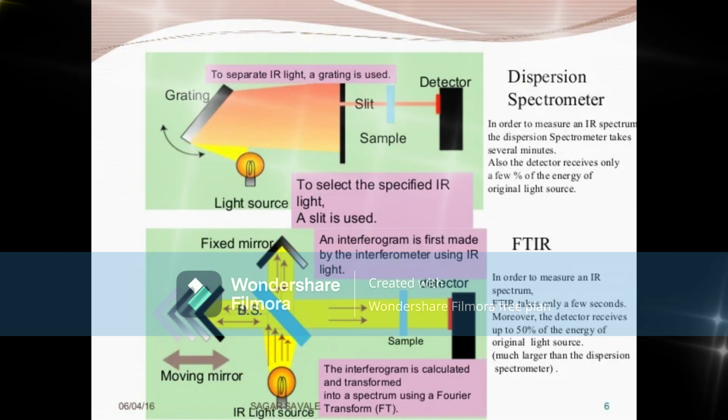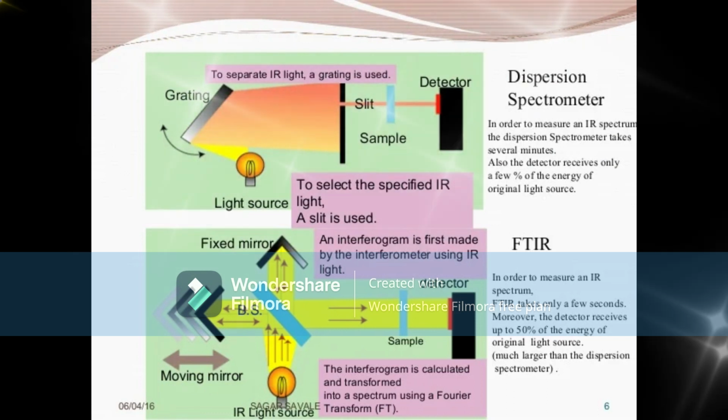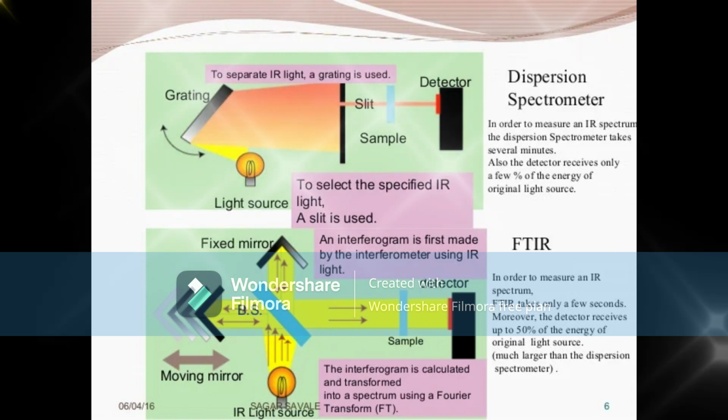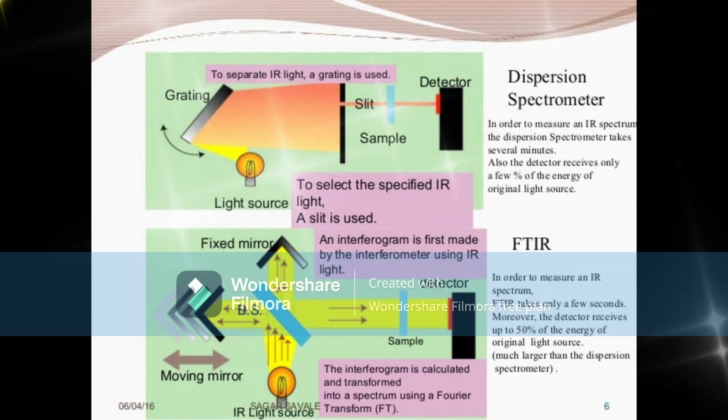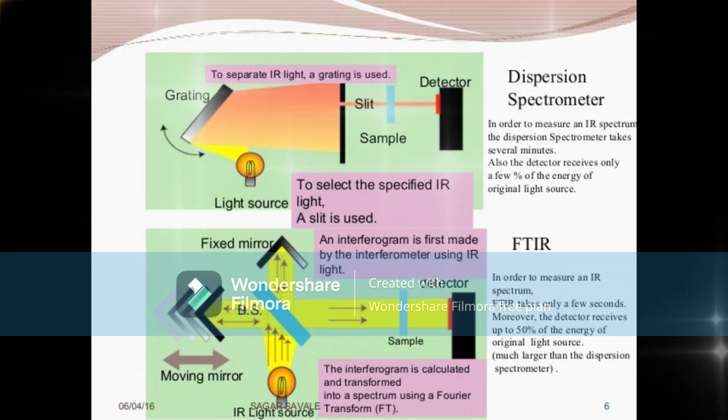It can increase speed, collecting a scan every second. It can increase sensitivity. It has greater optical throughput. It's mechanically simple with only one moving part.